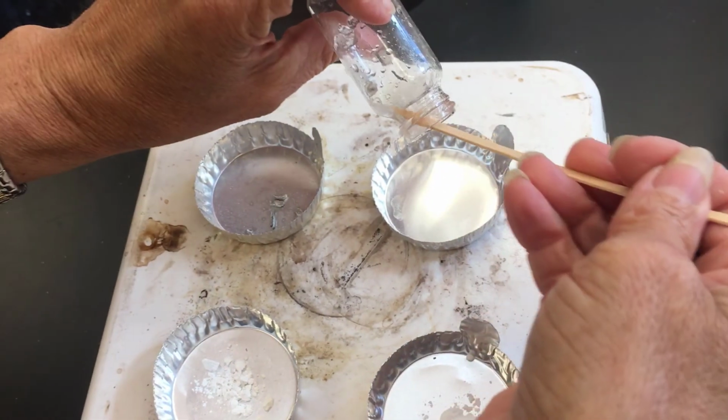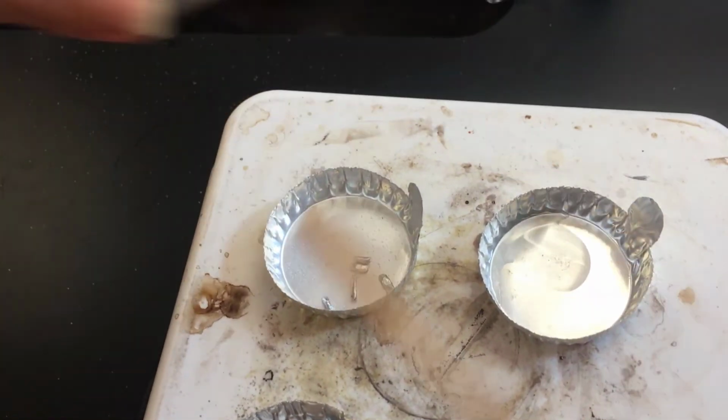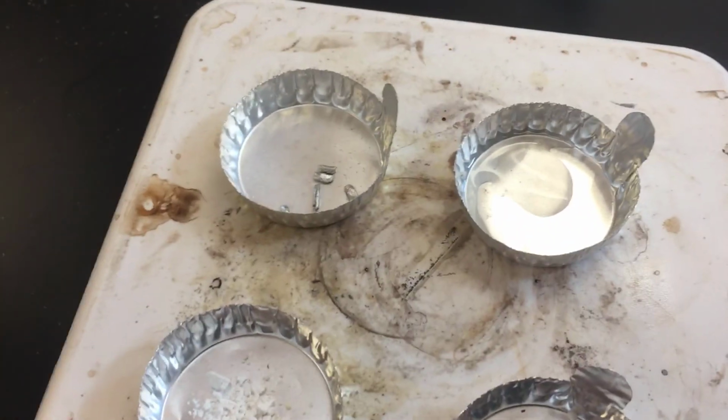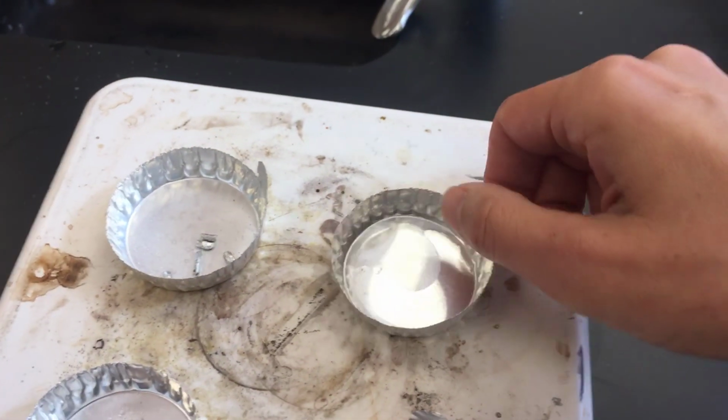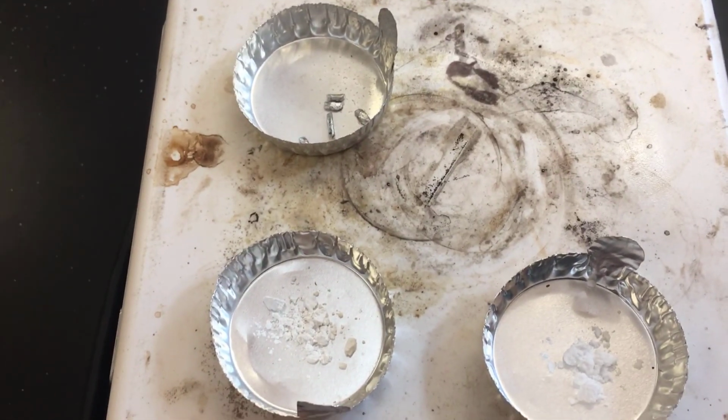And let's get some number 3 into this. And that became liquid almost instantly when I put it on. So we'll take it right off, and now we will wait to see the response in the other 3.